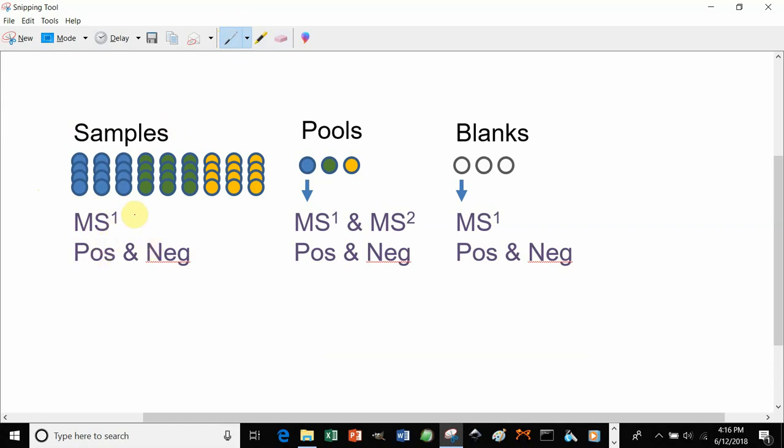LipidMatchFlow will work for data which also has auto-MSMS or some type of data-independent analysis, as long as there's full scans as well. But we recommend using full scan only because you'll have more scans across a peak, which will lead to better integration and better peak area calculations.